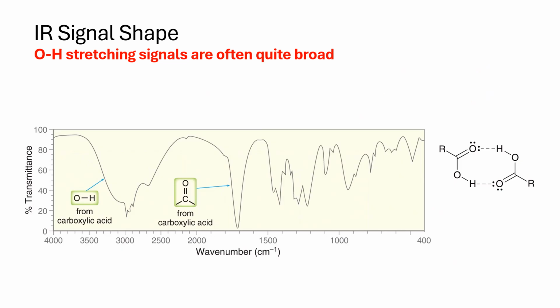So here, this is a typical spectrum of a carboxylic acid. Carboxylic acids are like that because they are very broad. These can form dimers. That is a dimer, so 2 molecules getting together. And what do we have? A carbonyl, that's this one here. And you have the OH, very wide. And the other peaks that we have here are likely to be carbon sp3 hydrogen, but the OH is pretty much covering that.